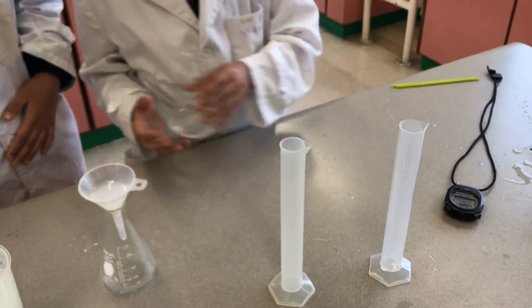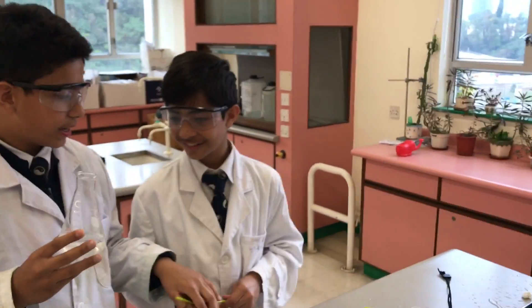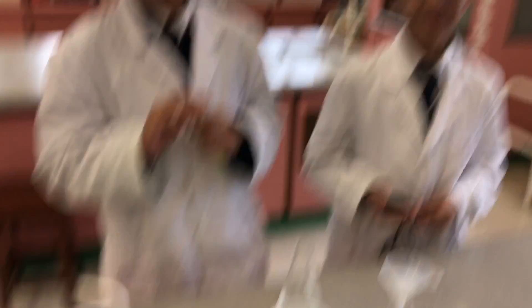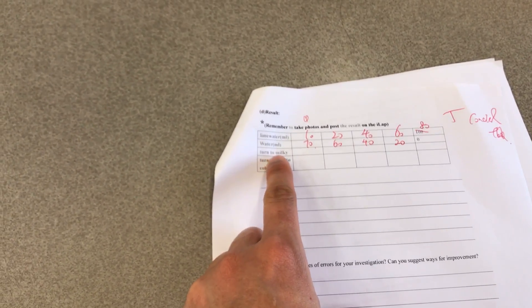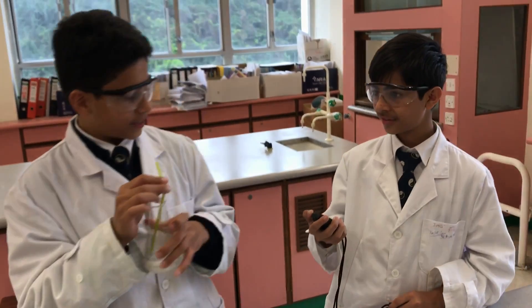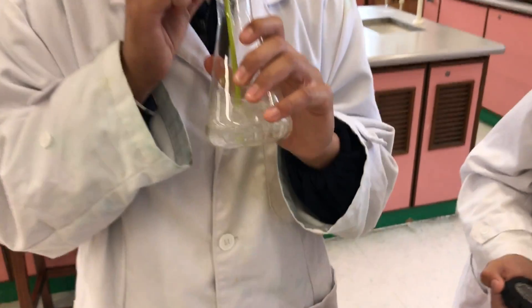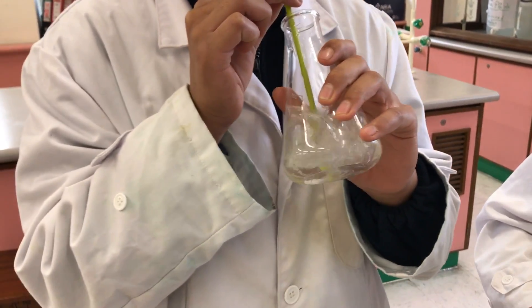Now I need your help to blow it. We're going to blow into it to see if it turns milky. Atal, can you start the timer please? According to this column of your results, you can use the stopwatch to record the time for the limewater to turn milky. Okay, I'm going to do the experiment now. One, two, three, go.